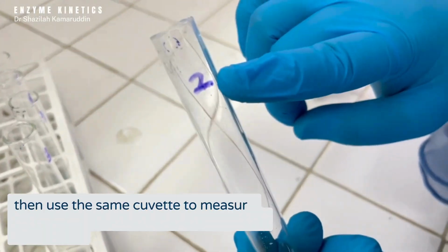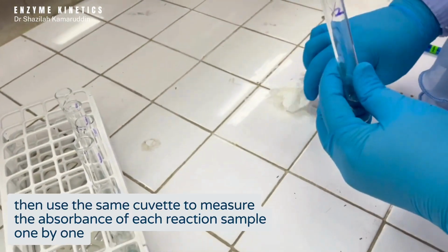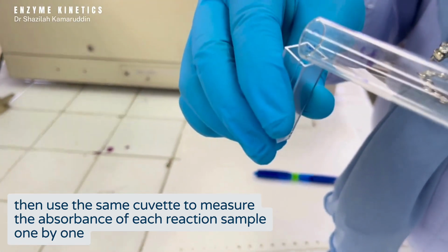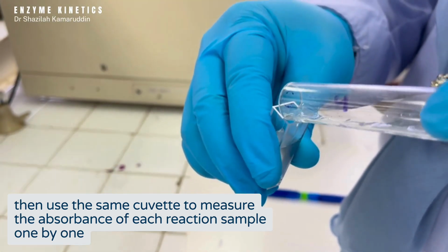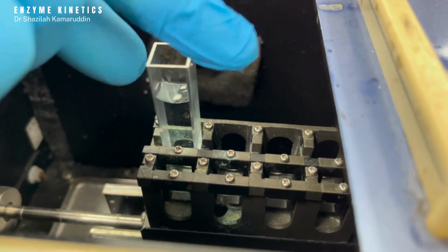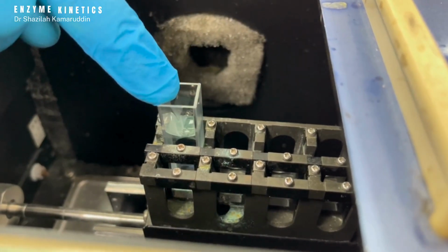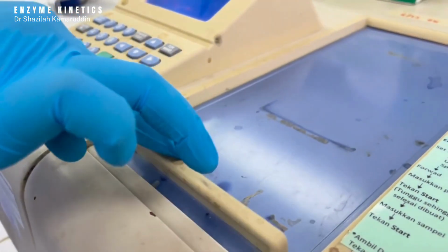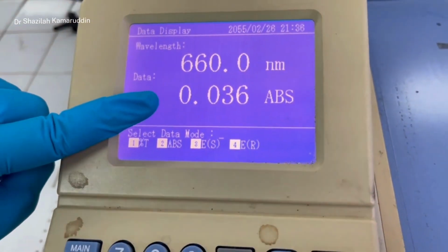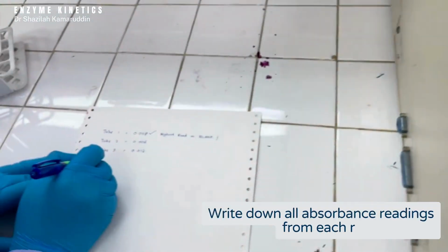Then use the same cuvette to measure the absorbance of each reaction sample one by one. Write down all absorbance readings from each reaction tube.